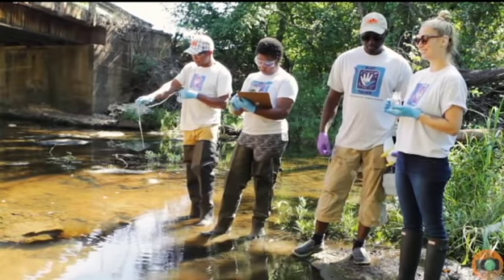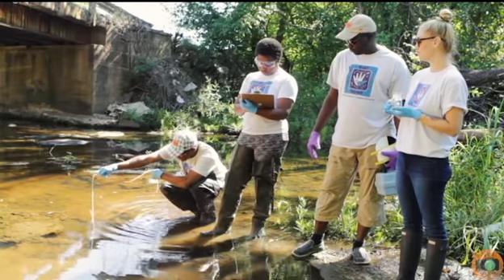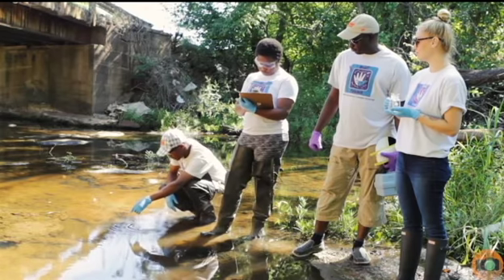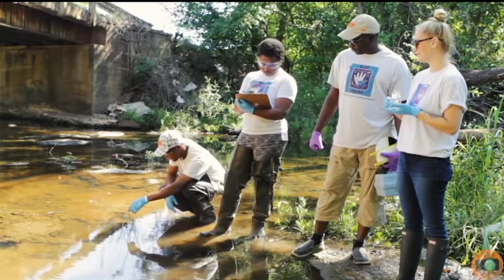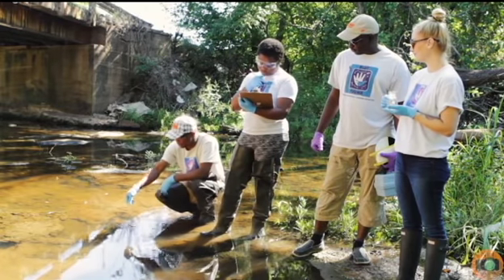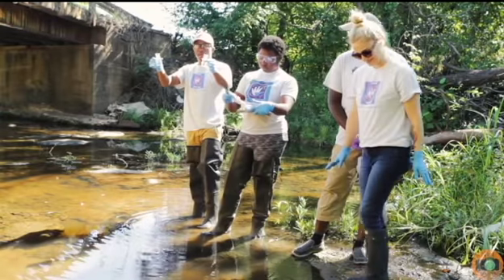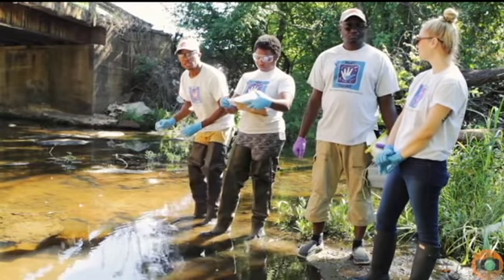And then the next thing we do is to measure the air temperature, which my colleague Anna just did, and then my role now is to measure the water temperature. And so you gently immerse this into the water and allow it to stay for about a minute, and then take the reading. So we now wait for that. So the reading is 26 degrees for the water temperature, and then following that we now collect the sample for the DO measurement. So this is the sampling bottle that we use for DO. So you gently take the sample for DO.